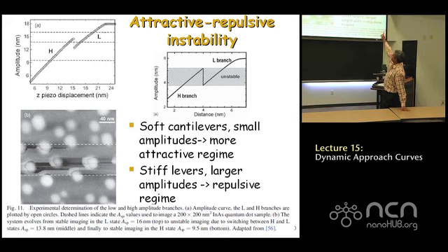In this case, as they were approaching the sample, they went down along the L branch, and this time the transition or the switching happened during the approach, okay? Whereas our switching, when we showed in the simulations, happened upon retraction. Here it happens upon approach. They found that suddenly there's a change in amplitude and it goes down.